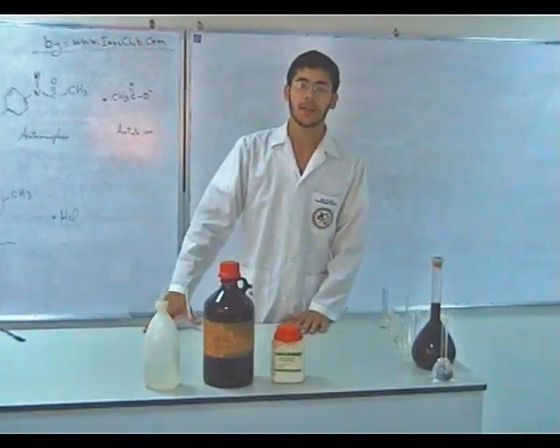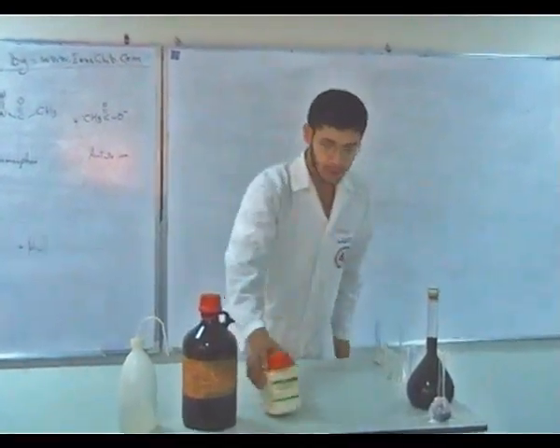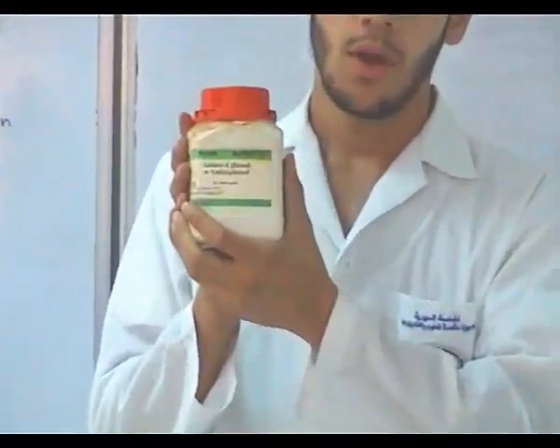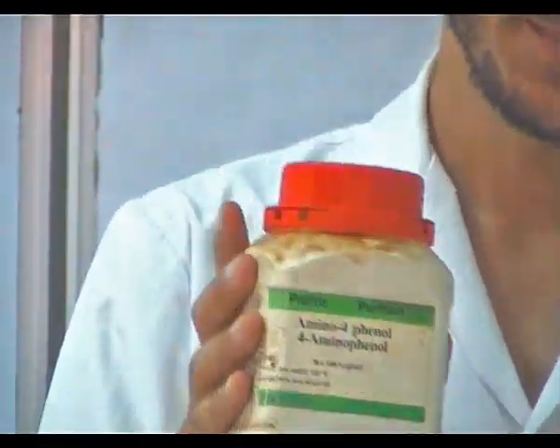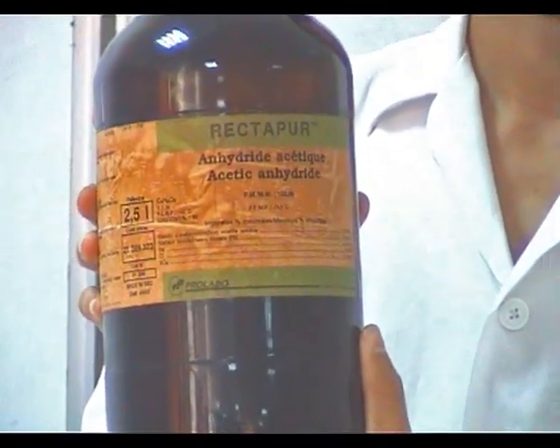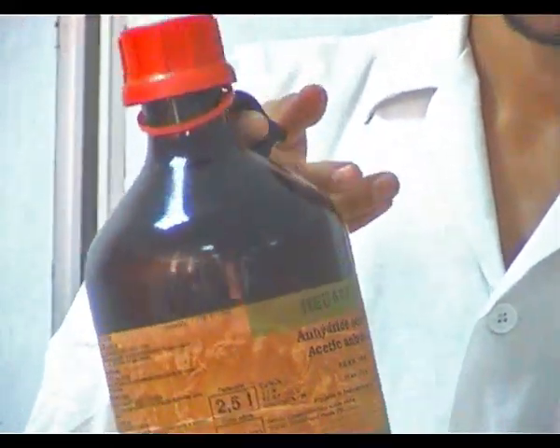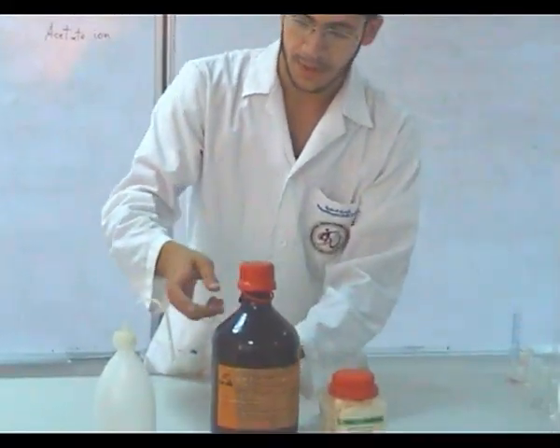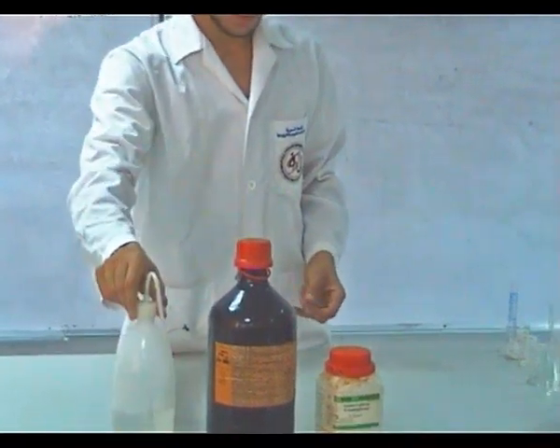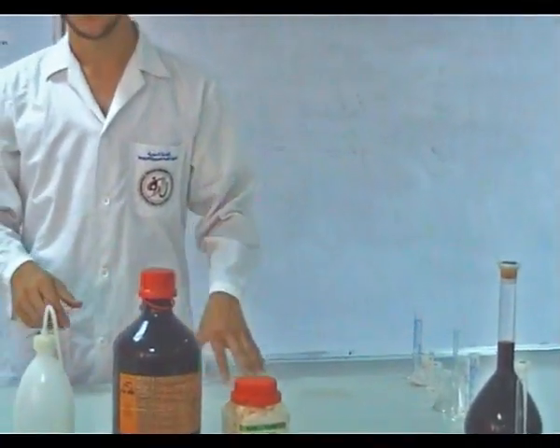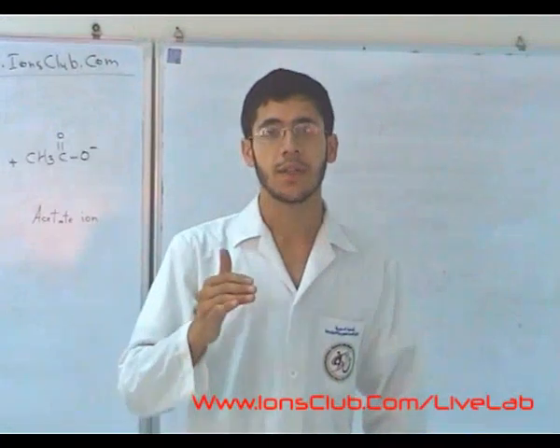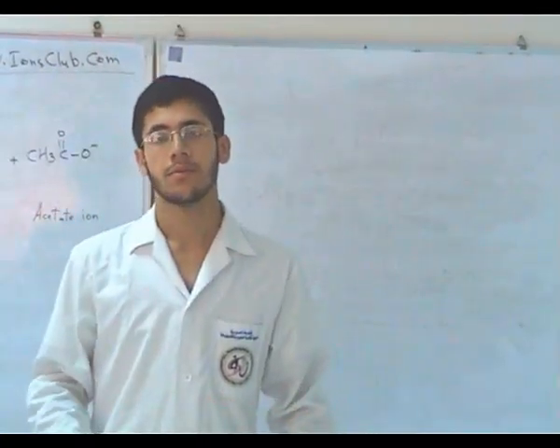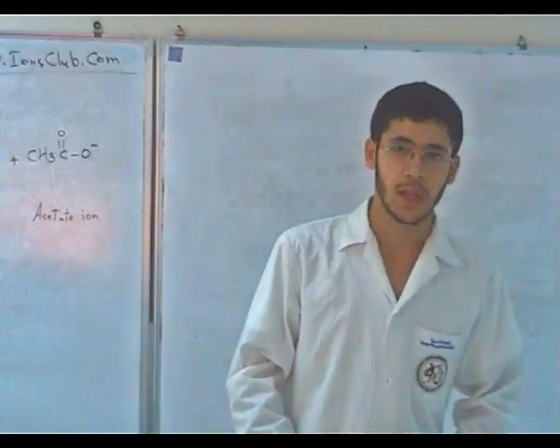Now the practical part of this movie. This is para-aminophenol, or it can also be called 4-aminophenol — they are the same. This is acetic anhydride; it has a brown color and can be distinguished by its smell. This is distilled water. You can read the procedure, weight, and volume of the reagents on the website of this movie at ionsclub.com.